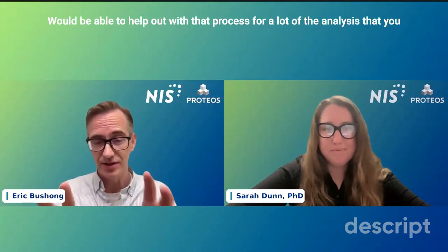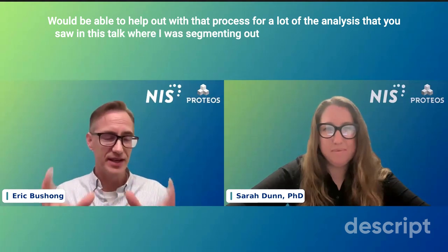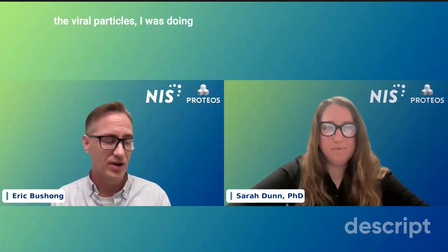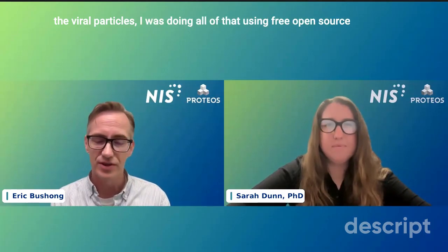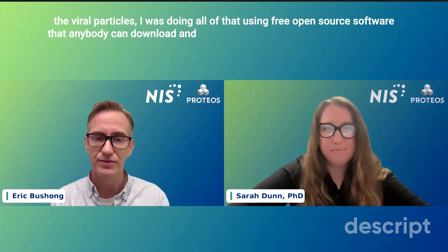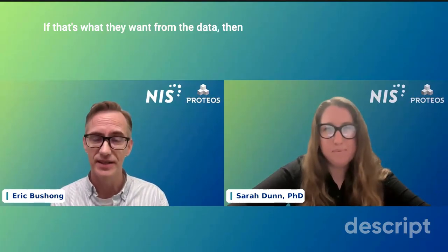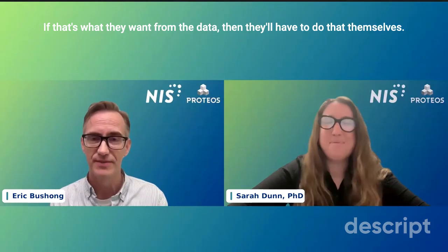For a lot of the analysis that you saw in this talk, where I was segmenting out the LNPs or segmenting out the viral particles, I was doing all of that using free open source software that anybody can download and use. And I would say it's really on the client. If that's what they want from the data, then they'll have to do that themselves. A lot of work.